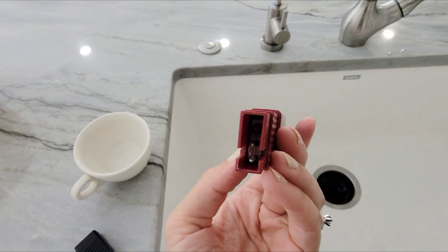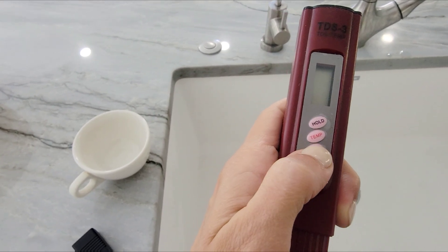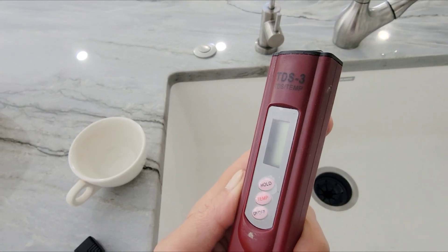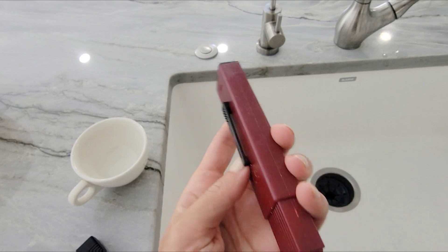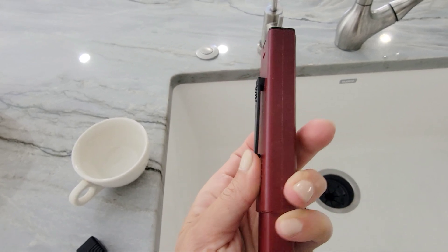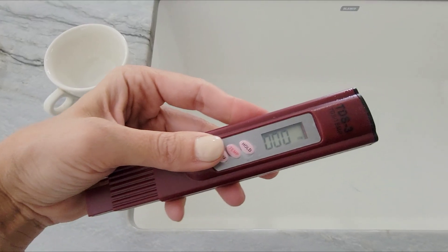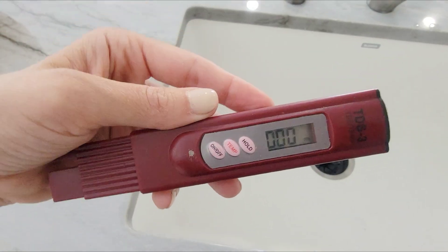The tester is so cool. It has like two little metal knobs — on, temperature, and hold. It's like the back of a pen. You can clip it onto your pants or pocket and press on, and it measures PPM.